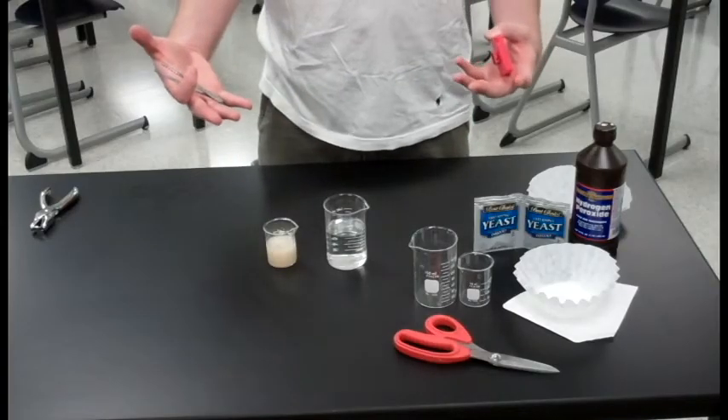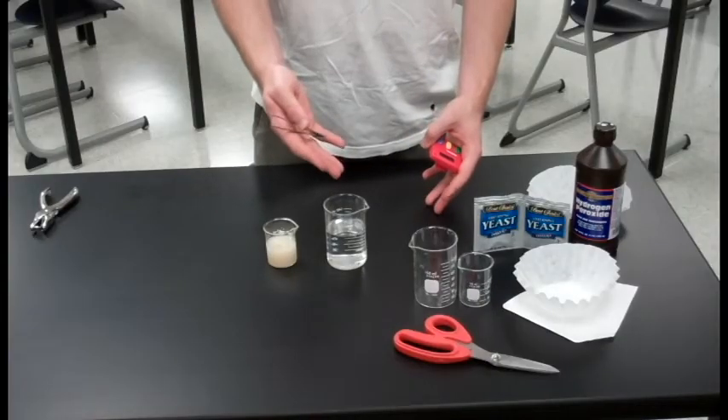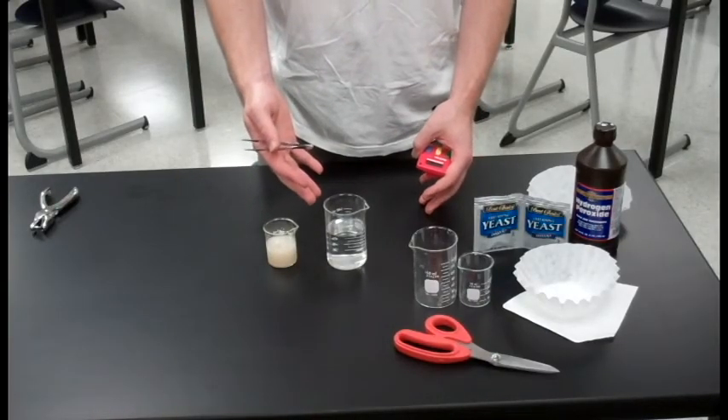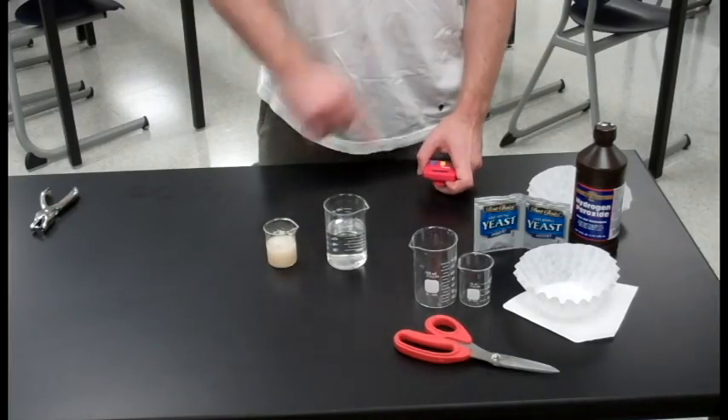That's really all there is to the basic procedure. From here you can manipulate any number of variables including the temperature of either solution, the concentration of your hydrogen peroxide, or anything else — the limit is really only your imagination. Good luck.